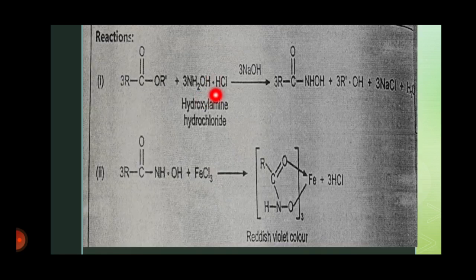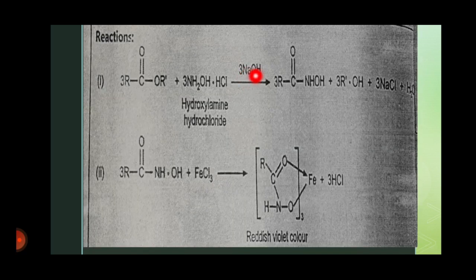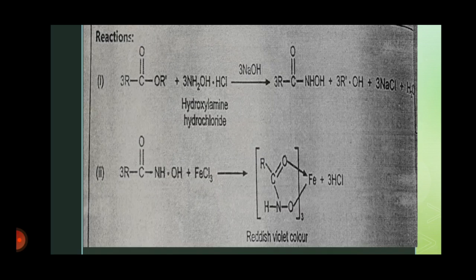We react it with FeCl3 to form a reddish violet colored compound. It indicates the presence of ester.